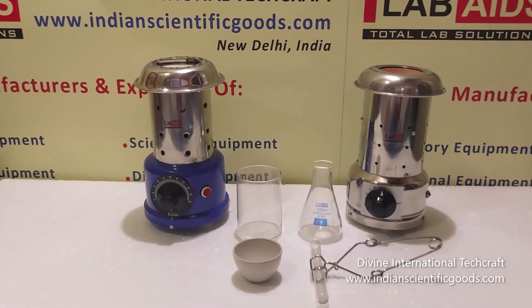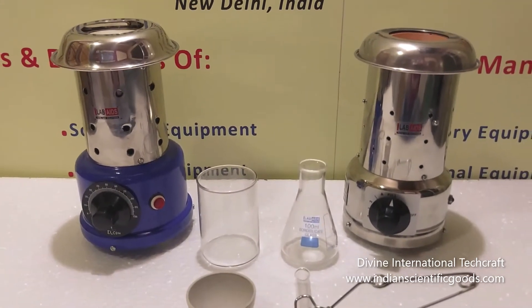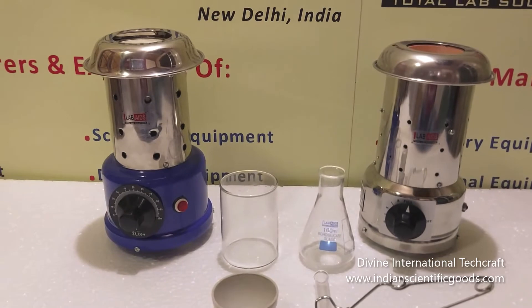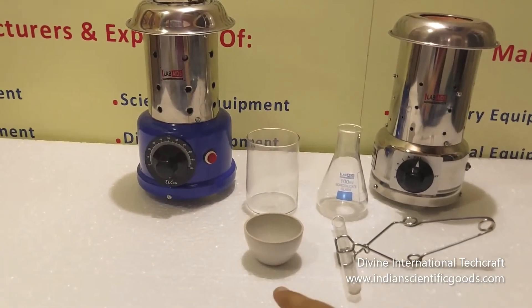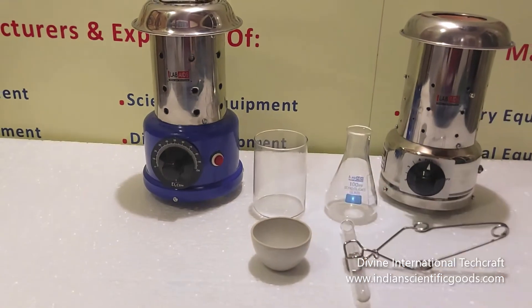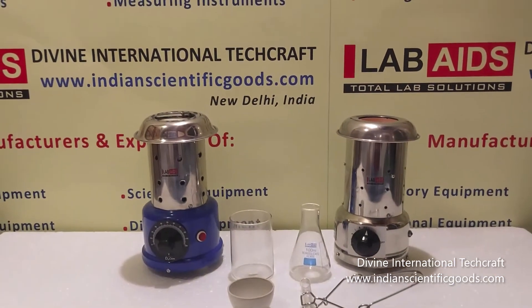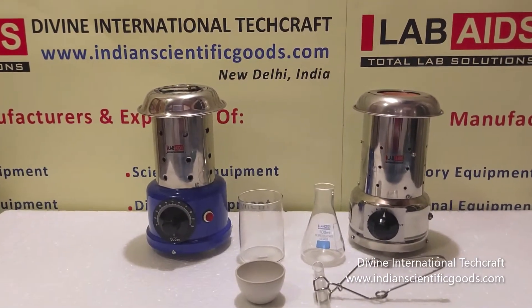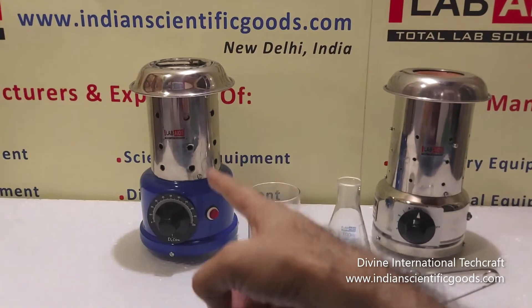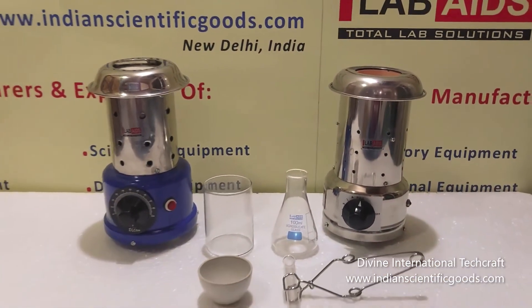These have a high temperature heat source designed for general purpose laboratory use. These are suitable for the non-contact radiant heating of materials in test tubes, crucibles, small flasks and beakers. Each Bunsen radiant heater bowl is constructed within a robust corrosion-resistant cylindrical stainless steel plus mild steel housing. A full stainless steel model is also available.